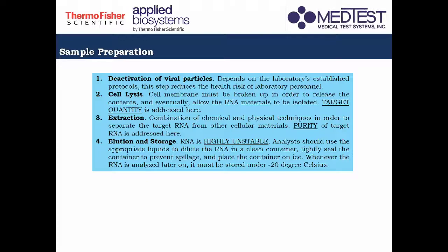So depending on the protocol that you are using, kumbaga ito yung mag-dictate kung gaano ka pure yung RNA na makukuha mo. So when we say purity, it means na walang ibang cellular materials na naka-include dun sa ipaprocess mo. Because at the end of the sample preparation, what we want is just the RNA.